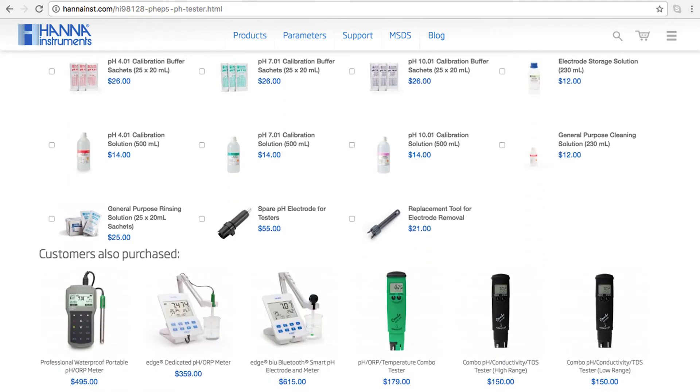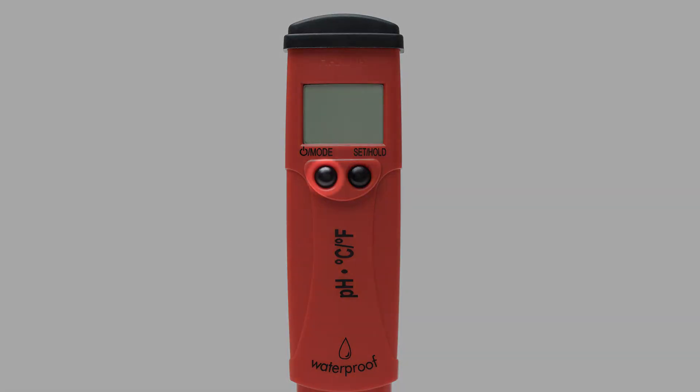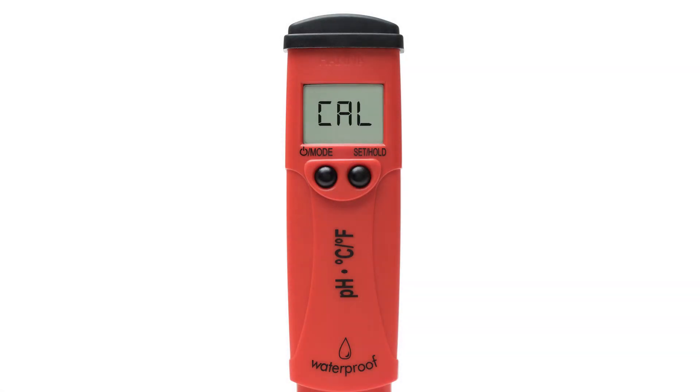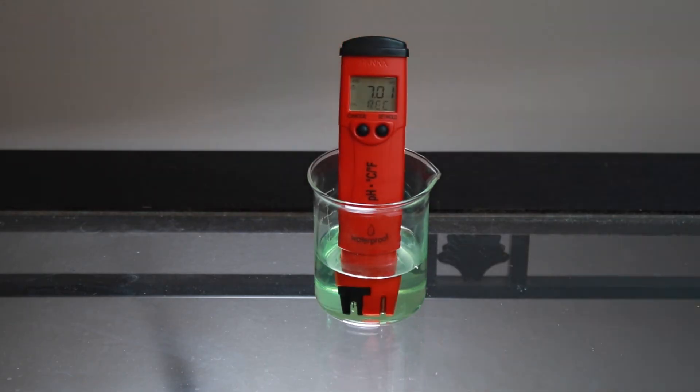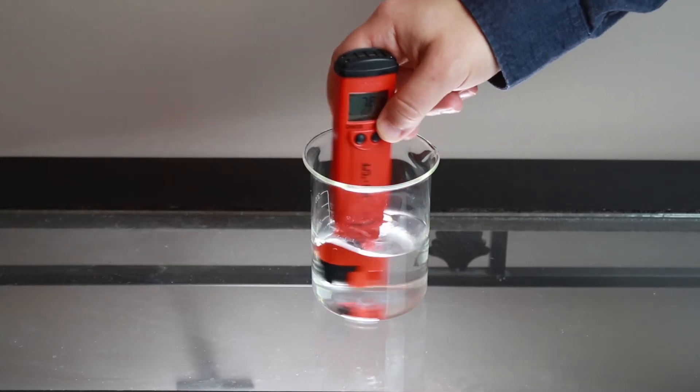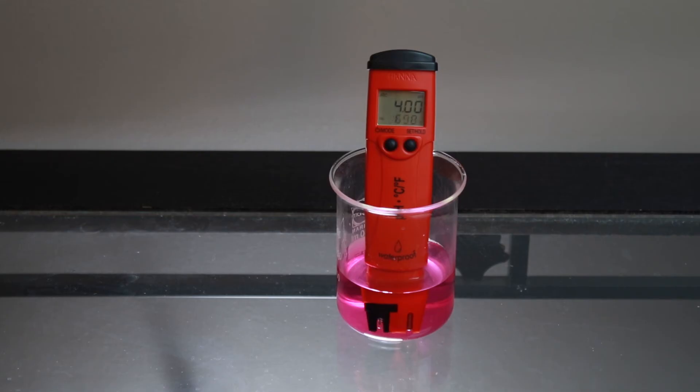If you need any solutions, you can find everything for your tester right on the product site. To calibrate your meter, press the mode button for three seconds until cal is displayed. We recommend a two-point calibration. Place your electrode in your HANA pH calibration buffer. Your pH tester automatically recognizes which buffer you use first. Once complete, place your tester in the next buffer. After it's complete, the meter will automatically return to measurement mode.